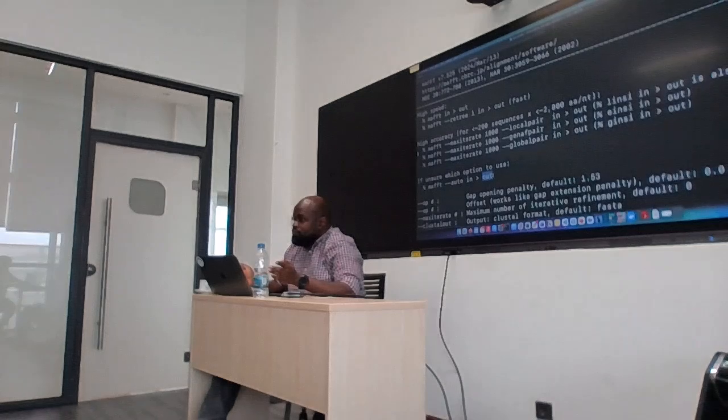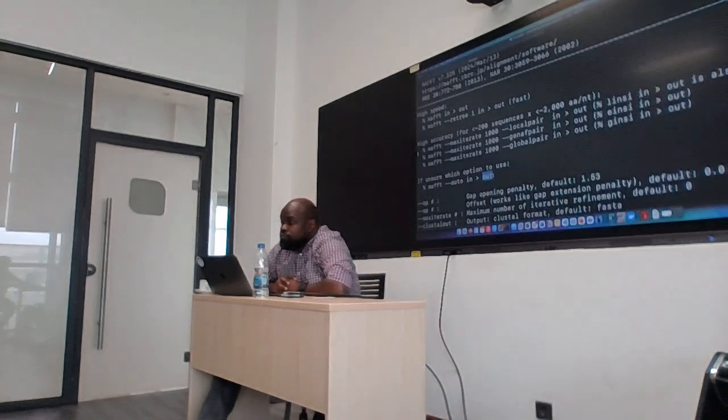That option, if I'm unsure which option to use, that's all. You are unsure what?